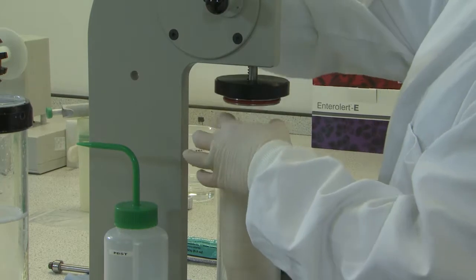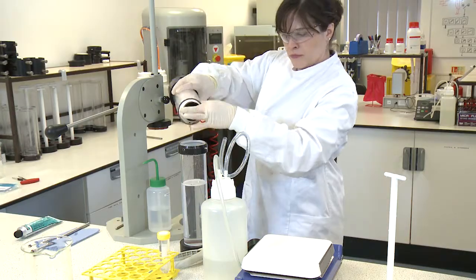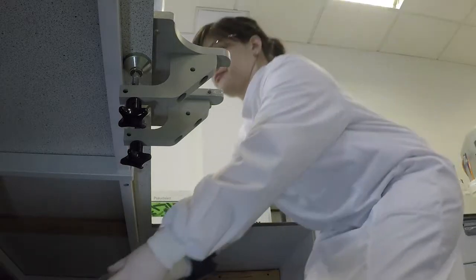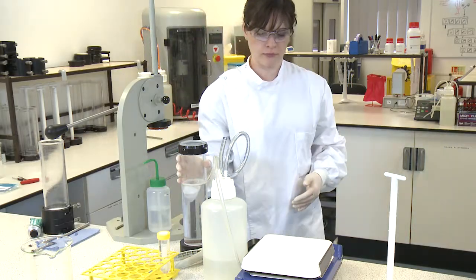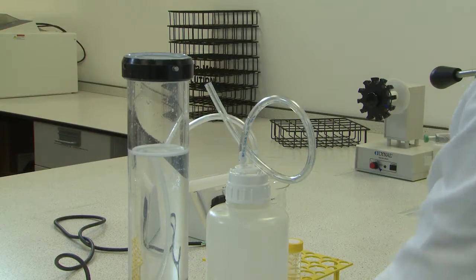Tip any remaining liquid in the elution tube into the concentrator tube, taking care to ensure the foam discs remain in the elution tube. Dispose of the foam discs from the elution tube. Place the assembled concentrator tube on a magnetic stirrer plate.